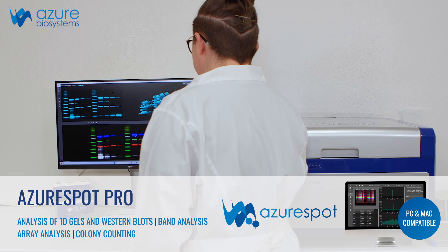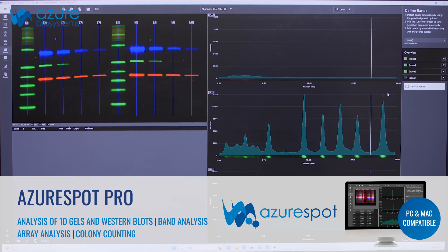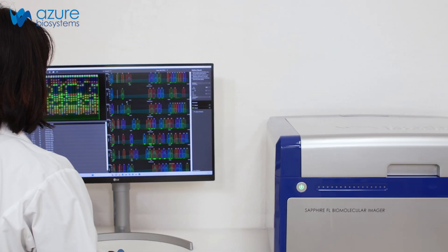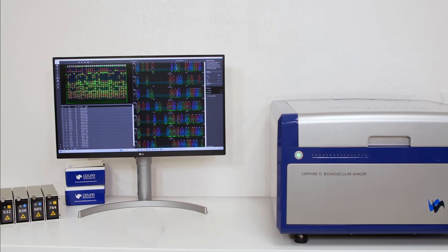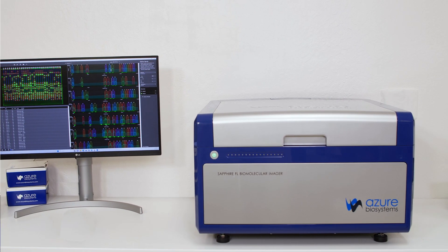Quantitative image analysis is made possible through Azure's flexible and intuitive analysis software. The many innovative features of the Sapphire FL make it the most powerful and flexible biomolecular scanner in its class. To learn about additional applications supported by the Sapphire FL, visit azurbiosystems.com/sapphirefl.